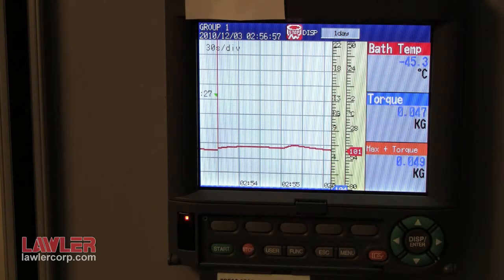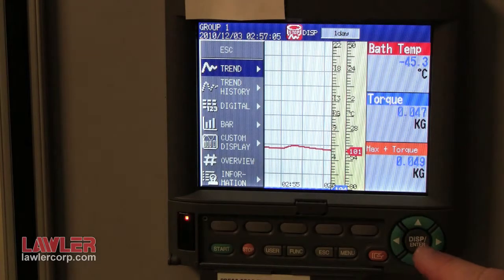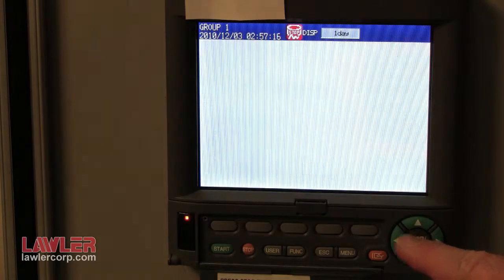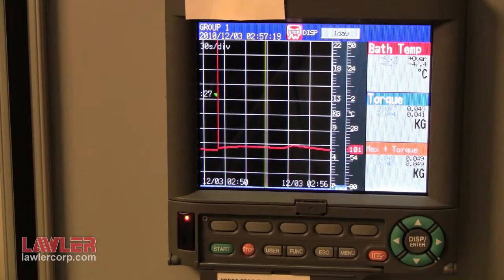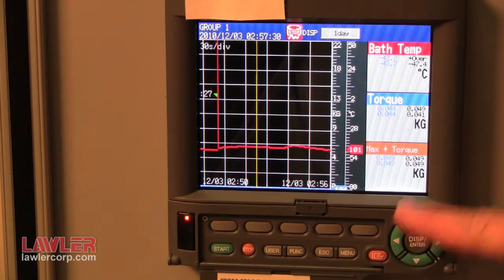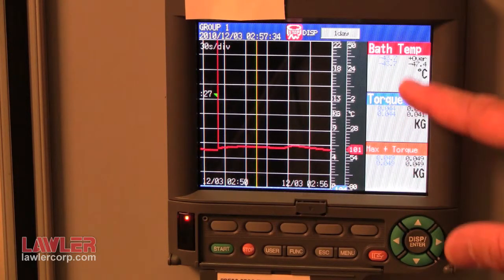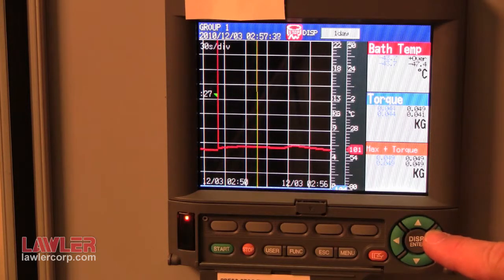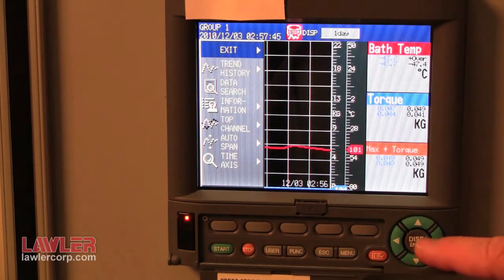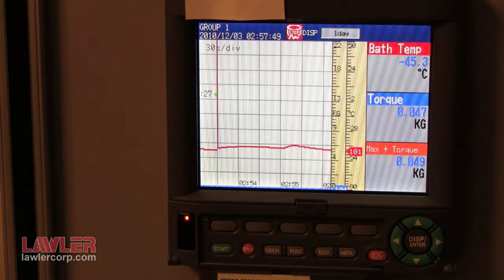The recorder has a historical mode that can be used on screen instead of going to the computer and using the compact flash. Press the enter button and you can navigate to the menu on screen. You can see that the recorder is in inverse video to indicate that it is in historical mode. You can use the arrow keys to navigate a yellow line across the screen to the desired point, and values are displayed digitally under each variable's tag name. To return, simply press exit and you are back into recording mode.